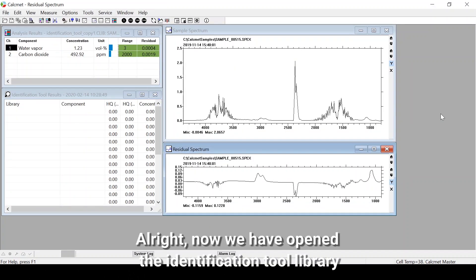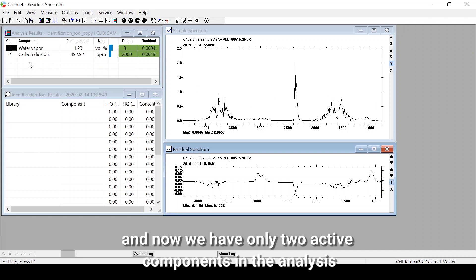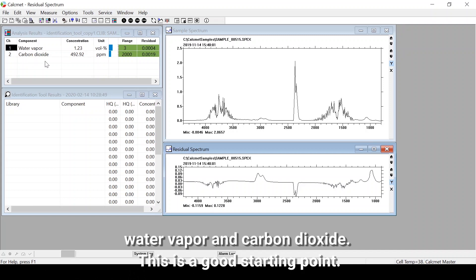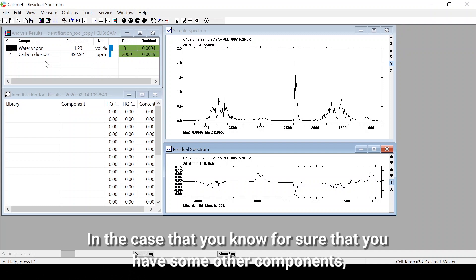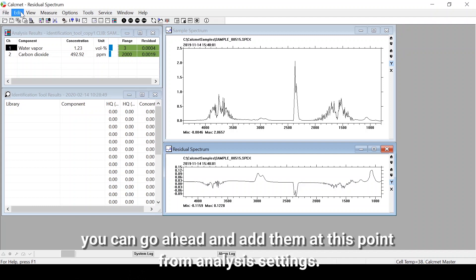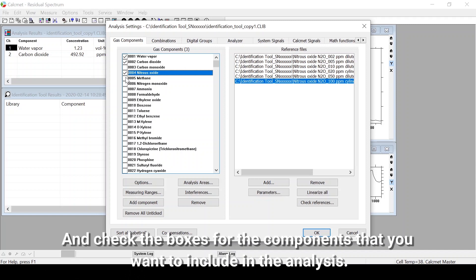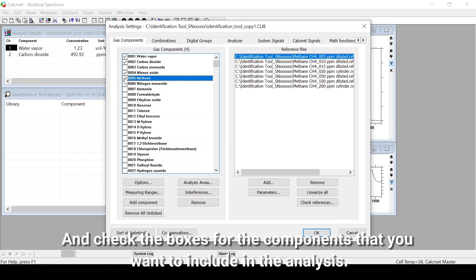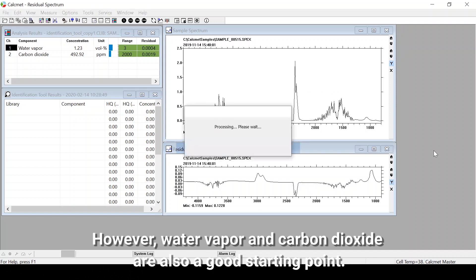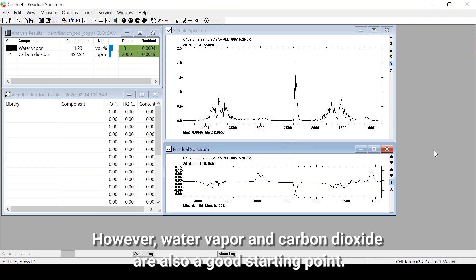Now we have opened the identification tool library and we have only two active components in the analysis: water vapor and carbon dioxide. This is a good starting point. If you know for sure that you have some other components, you can go to analysis settings and check the boxes for the components you want to include in the analysis.